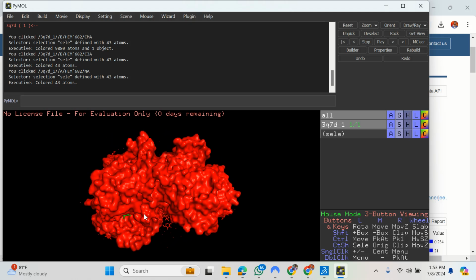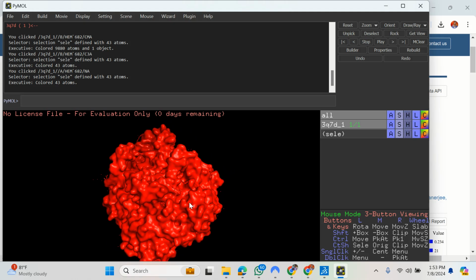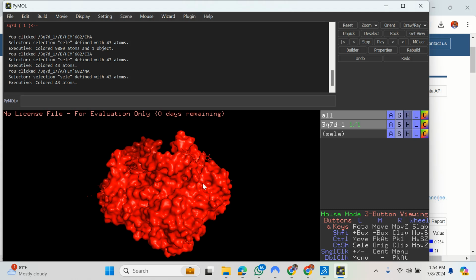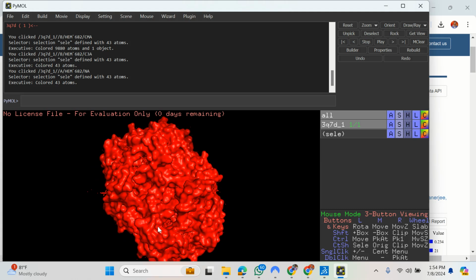It should be somewhere close to. Inside this file, can you clean it? Yeah, you can. But you see that inside, I'm supposed to find it here.